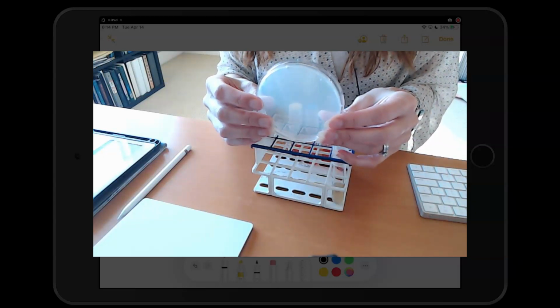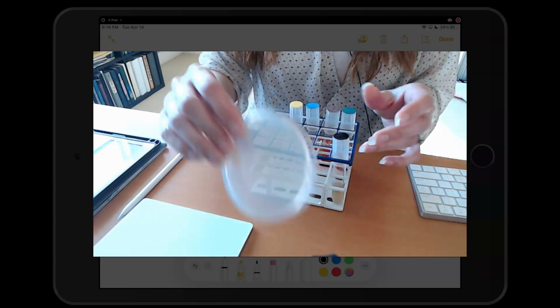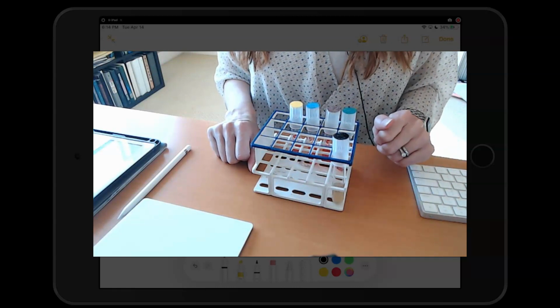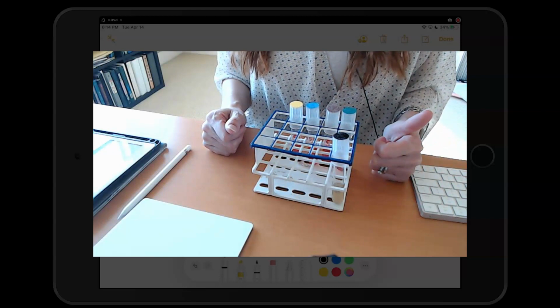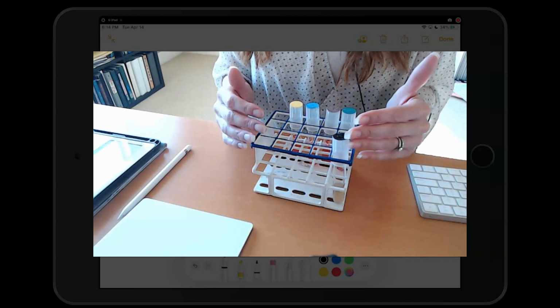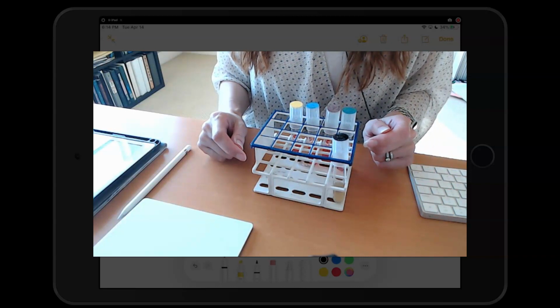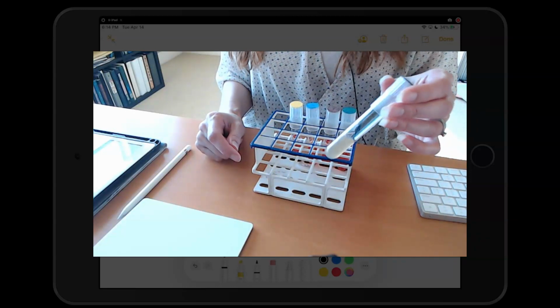So what are gelatinase and amylase? These are two different types of exoenzymes. Some bacteria are going to produce these exoenzymes. Exoenzymes are enzymes that are made inside of the cell and then secreted to its environment to break down different things. Okay? In the case of our gelatinase enzyme, the bacteria will produce gelatinase, some bacteria, which is an enzyme.